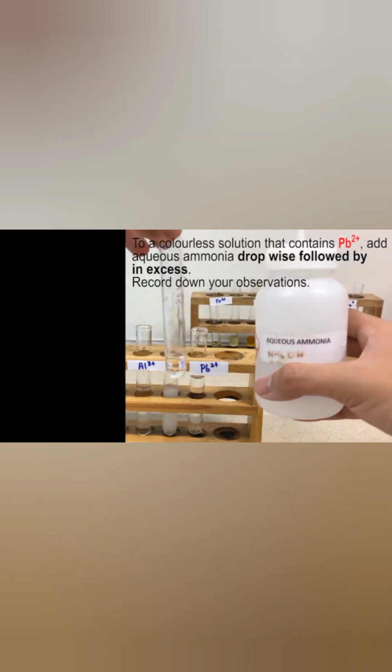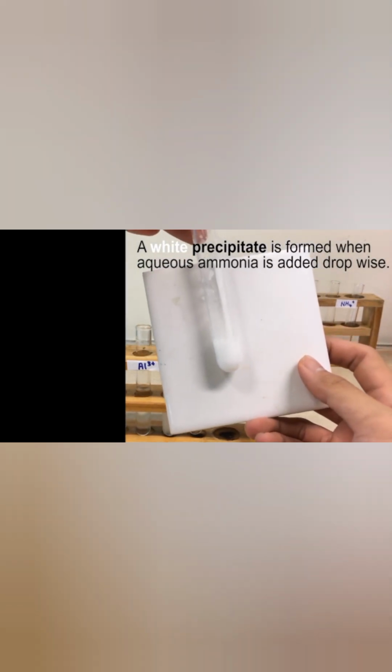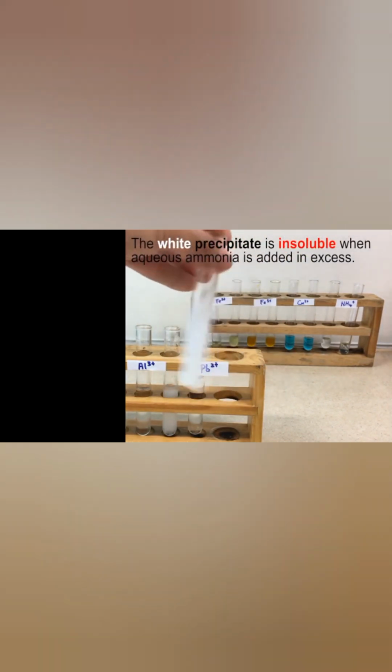Okay, to a colorless solution that contains lead, let's add aqueous ammonia in drop. Adding aqueous ammonia in drop and stirring, a white precipitate is formed. Now, adding excess of the aqueous ammonia solution, the white precipitate is insoluble. It refuses to dissolve.